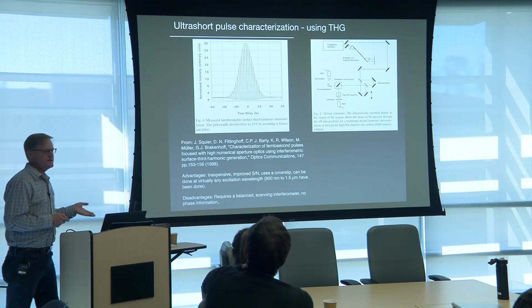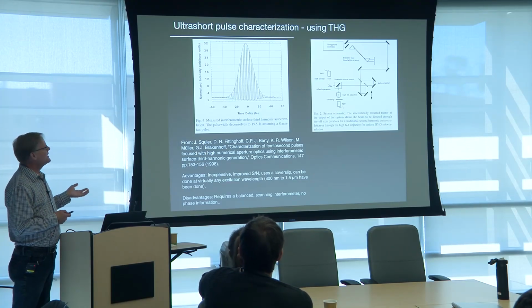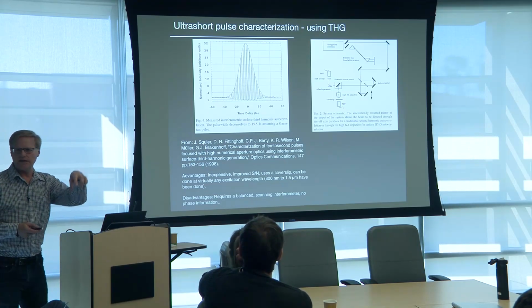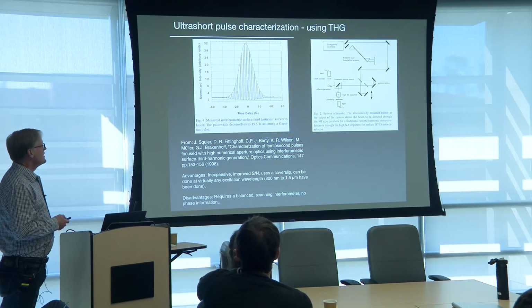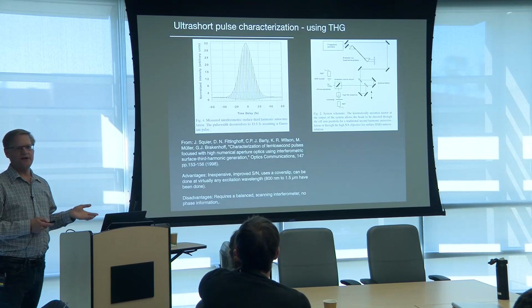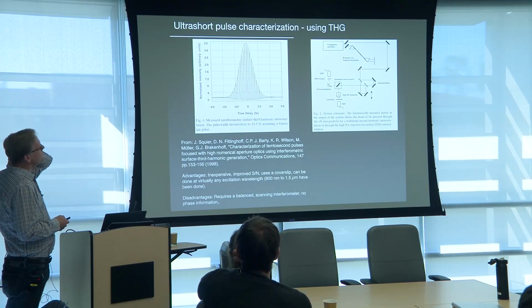Okay, so we'd like to do better. We want to get that phase information. And we want to stay collinear so you can really use it like you would inside the microscope, and go even to the full NA if you would like to. So we'd like to do something based on frequency resolved optical gating, techniques developed by Rick Trebino.